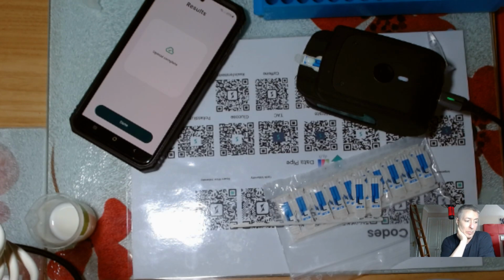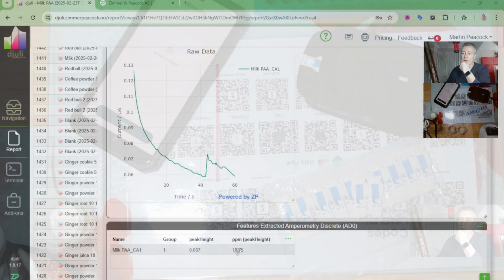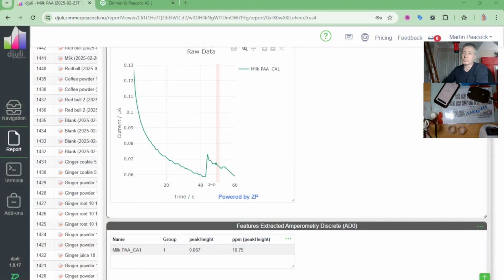And with that assay, we were probably getting down to about 20 ppm. But even at 20 ppm, I would argue that the signal is quite intense. With the right kind of scientific effort, there wouldn't be any problems. Going up is easy. Coming down, you can still see there's quite an intense signal there. Those of you with a scientific and engineering mind can understand that that's quite a lot of signal, and we can do fractions of that and still have a decent signal. Using the power of the backend database, I was able to go from just peak height or signal strength to actual ppms really quickly.